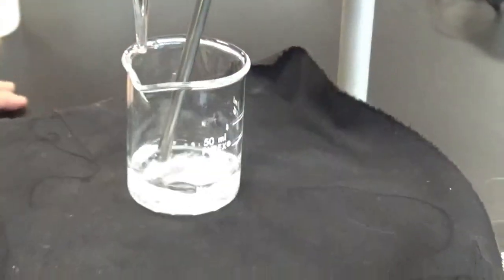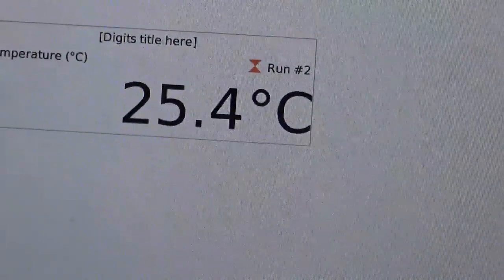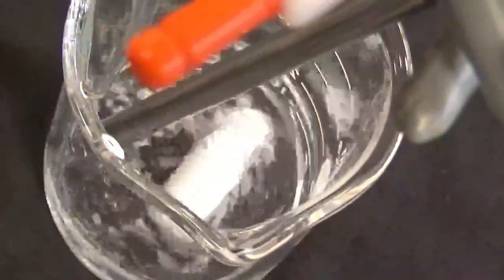Let's see what happens to that temperature. It's going down already. But you know, there's fewer crystals in there by a little. Let me show the picture. Just hold it down a little bit. Yeah, I know, that's what you have to do. Quite a few could left. You see, oh, look at that. It's less, but it's still quite a few.